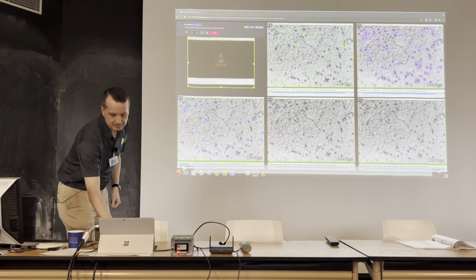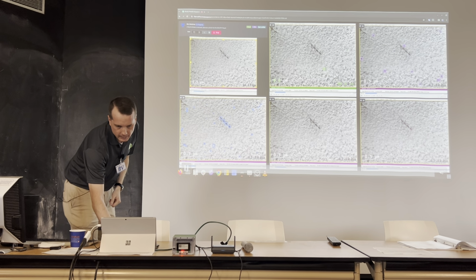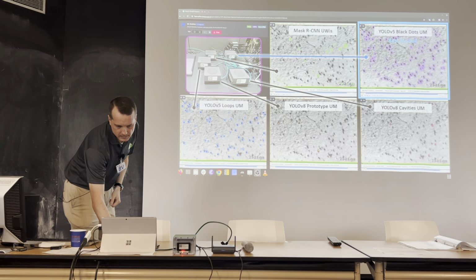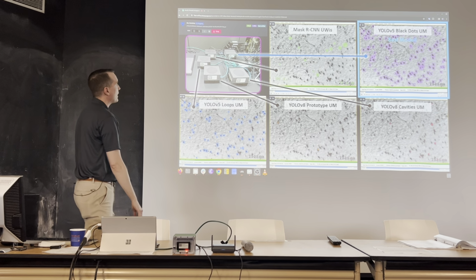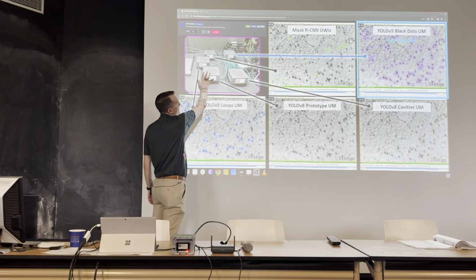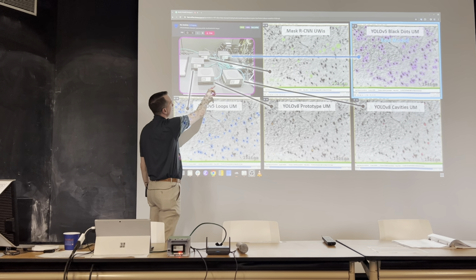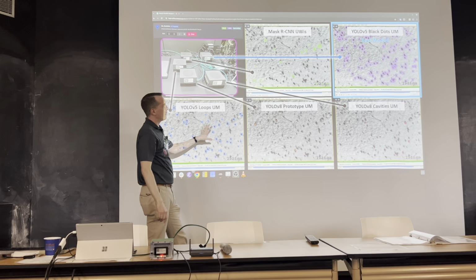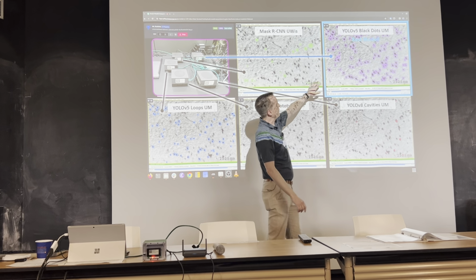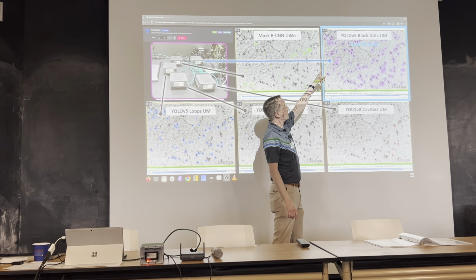And we can do this multiple times over and over. I don't know, that slide was twice. So what we found then is we were able to run the 5 models. These are the 5 orange that are connected to the in situ TEM at Idaho National Labs. And we ran all of those and we saw that, hey, our best model for this particular sample and this particular run was this YOLO V5.